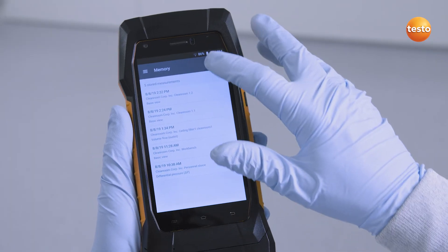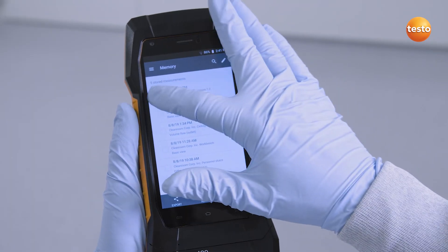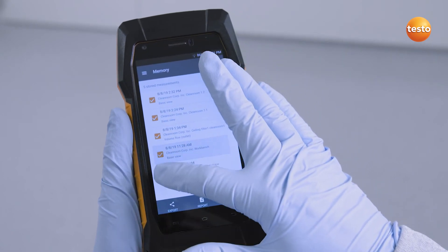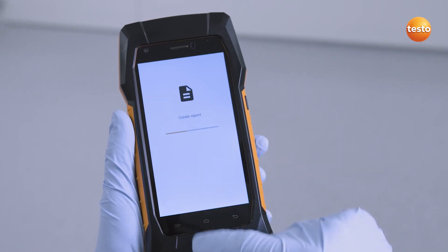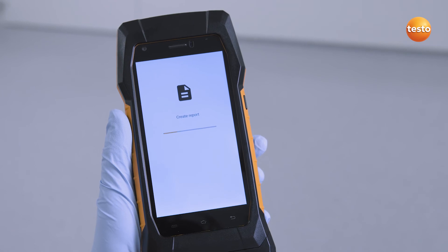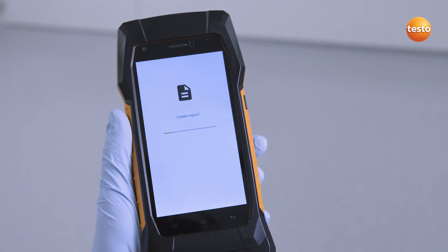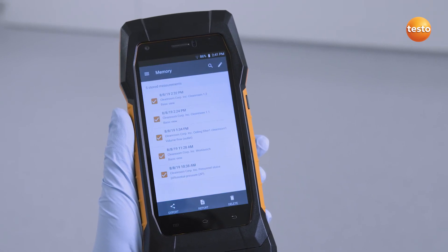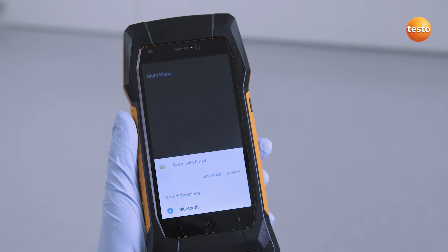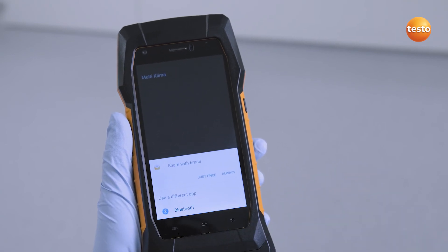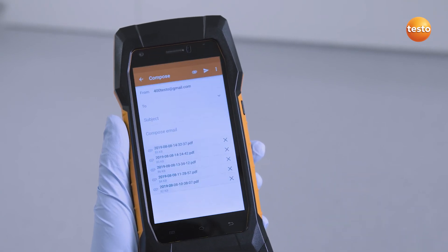The Testo 400 allows digital reports with all relevant information to be created quickly for all clean room measurements. You can send these as a PDF by email directly onsite.